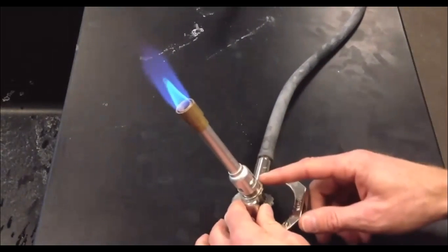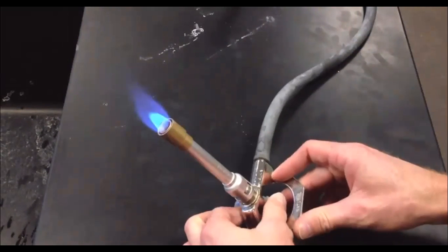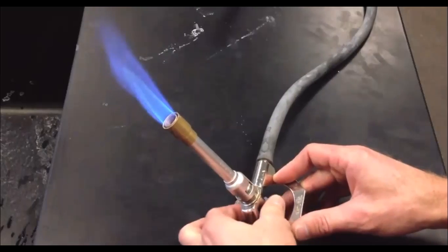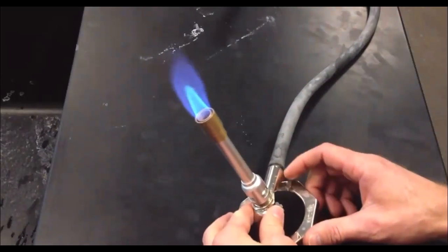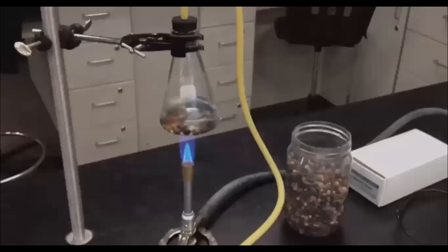If you're not getting enough flame, you can do one of two things. You can make this adjustment on the base here. Maybe that's reducing how much gas is coming out. By increasing this, you're increasing how much gas is going through, and that's way too much. Again, you just want kind of a normal flame there. So again, that looks pretty good. I'm going to be happy with that. Just wanted to show you some adjustments quick on the Bunsen burner.